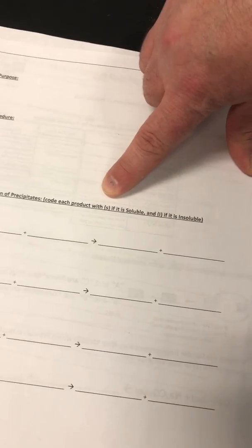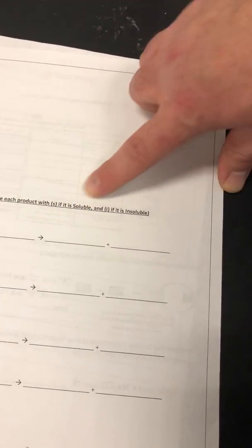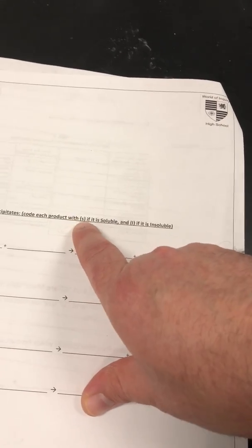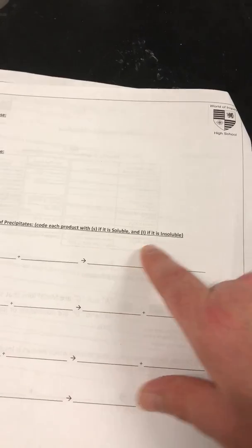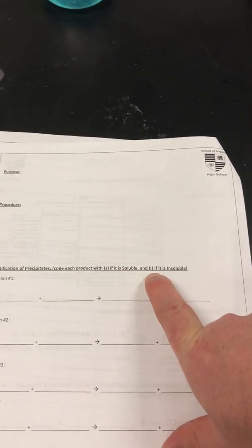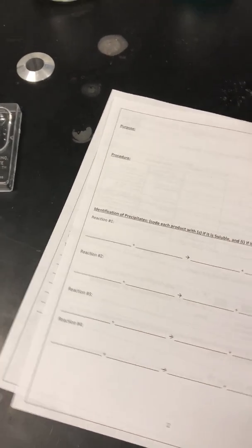And here's where the typo is from me. I forgot to label this the way we learned it in class. So you should cross off the S, which would be insoluble, not soluble, and write AQ if soluble. Make this AQ for soluble, and then S for insoluble, forms a solid. If you want to leave it like this, it was my mistake, I'll let it slide. But otherwise, make this AQ, make this S. Make sense? Okay, good.